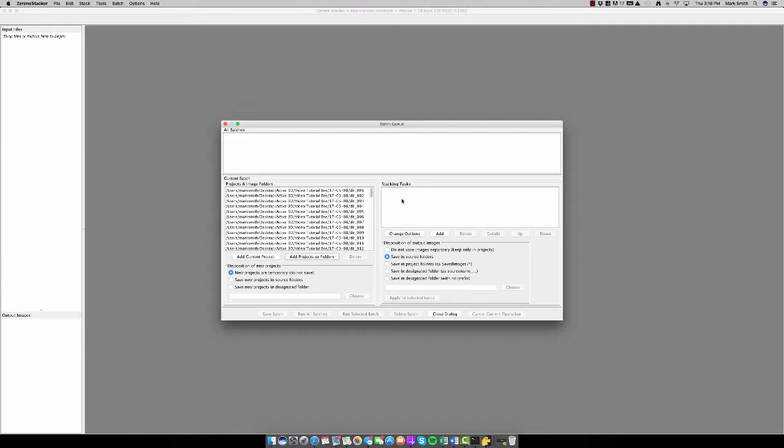Now you want to stack these photographs. So you want to add 2 tasks. First is align and stacking all of them using Pmax, and the next is to align all frames. So typically these are aligned automatically. You can see the align and stack. I just check this anyways. I don't know why, you don't have to, but I do out of habit. So now I'm just going to press OK, and now I have my stacking tasks all set up.